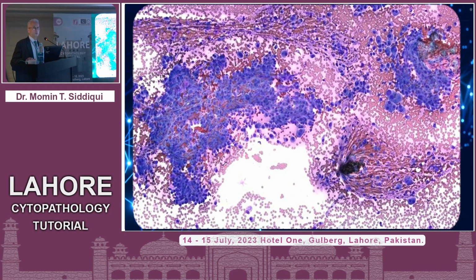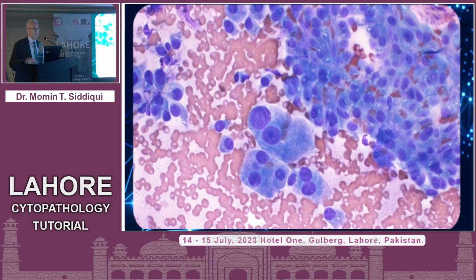Low power view. I'm going to test you now. You've been listening so attentively, so you should know all the tumors. Obviously quantitation is not a problem. It's got plenty of tumor cells, quite vascular, some hobnailing, blood vessels traversing through it, size variation, free floating cells in the background, high NC ratios, small cells, large cells. It doesn't look like squamous cells. At higher magnifications, more polygonal in shape, but rounded cells are there.